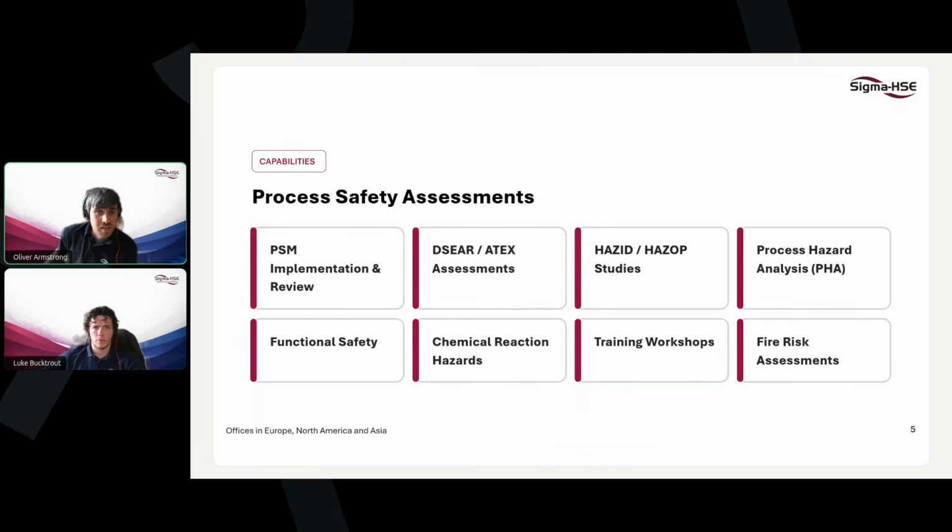So to understand next how such a small and widely used laboratory instrument can really help with process scale, bulk scale assessments in industry, Luke is going to talk next about some of the basic principles of the DSC.